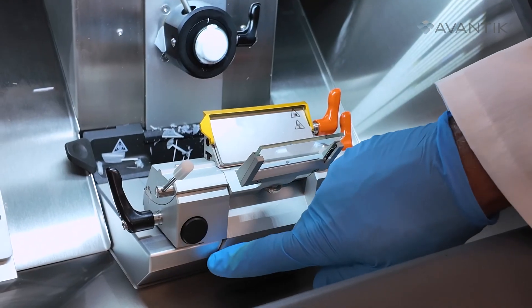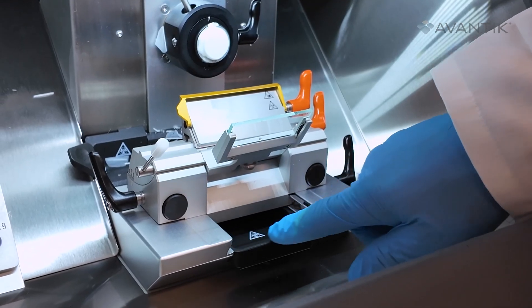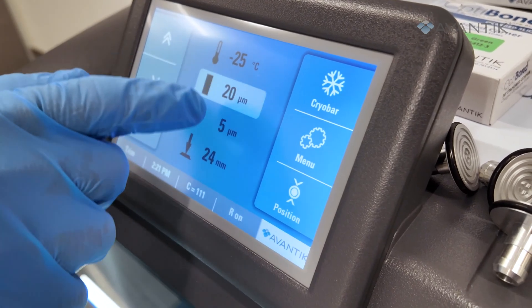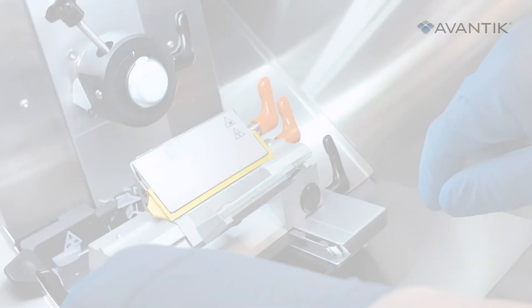The QS12's dovetail clamping knife holder helps eliminate chatter, venetian blind, and thick-thin sectioning. Additionally, the controlled trim function and anti-roll plate help assist with making quality sections.